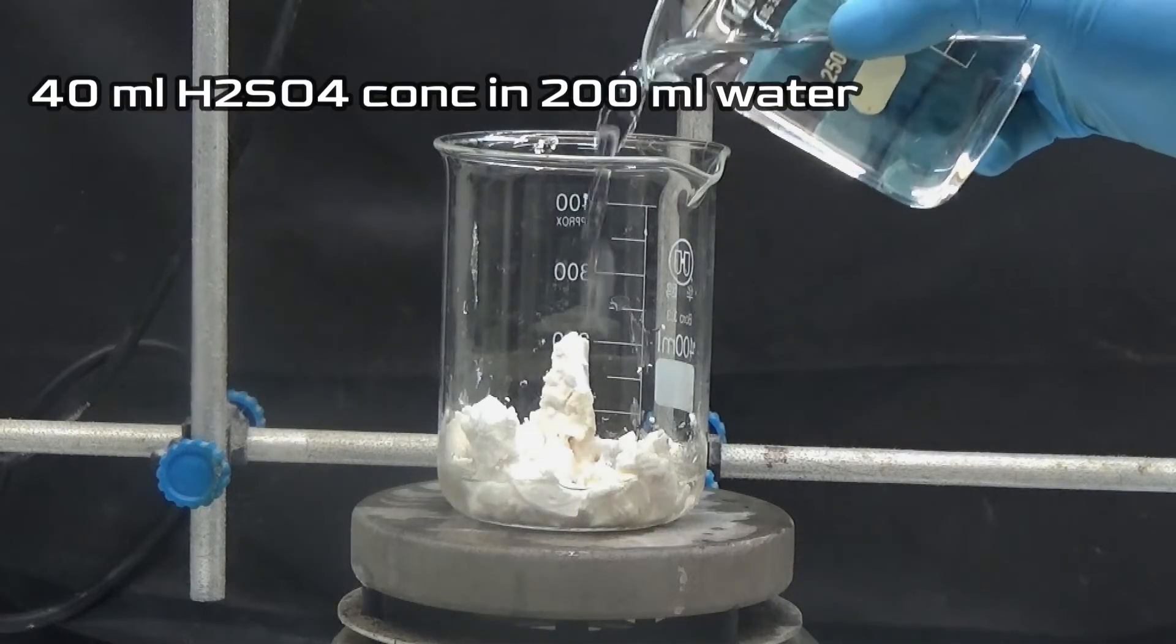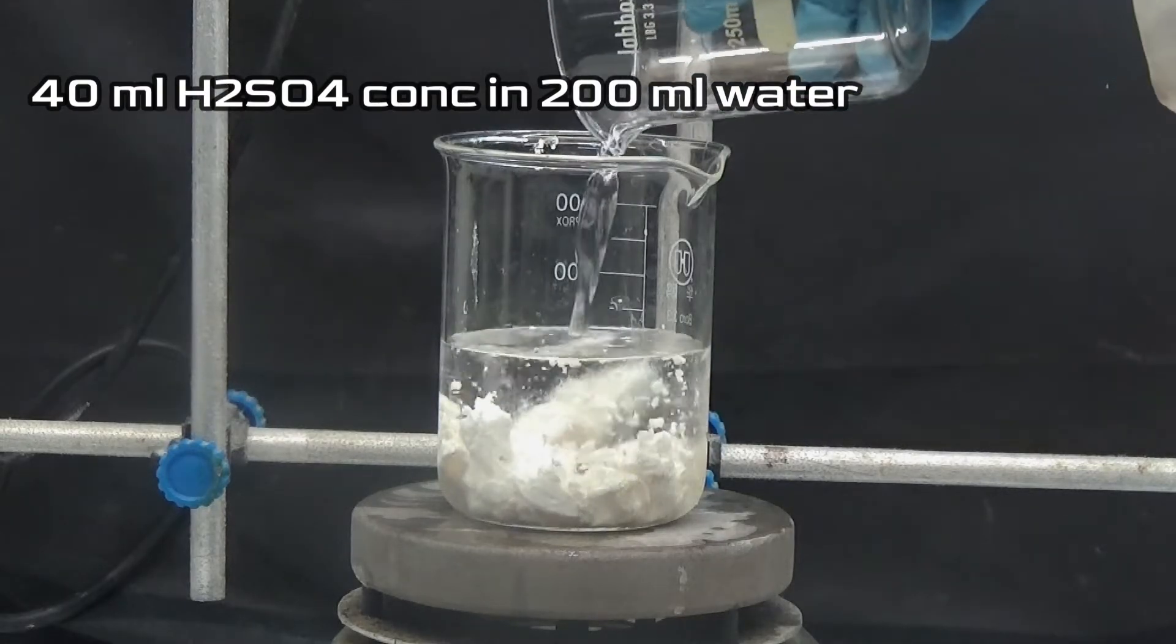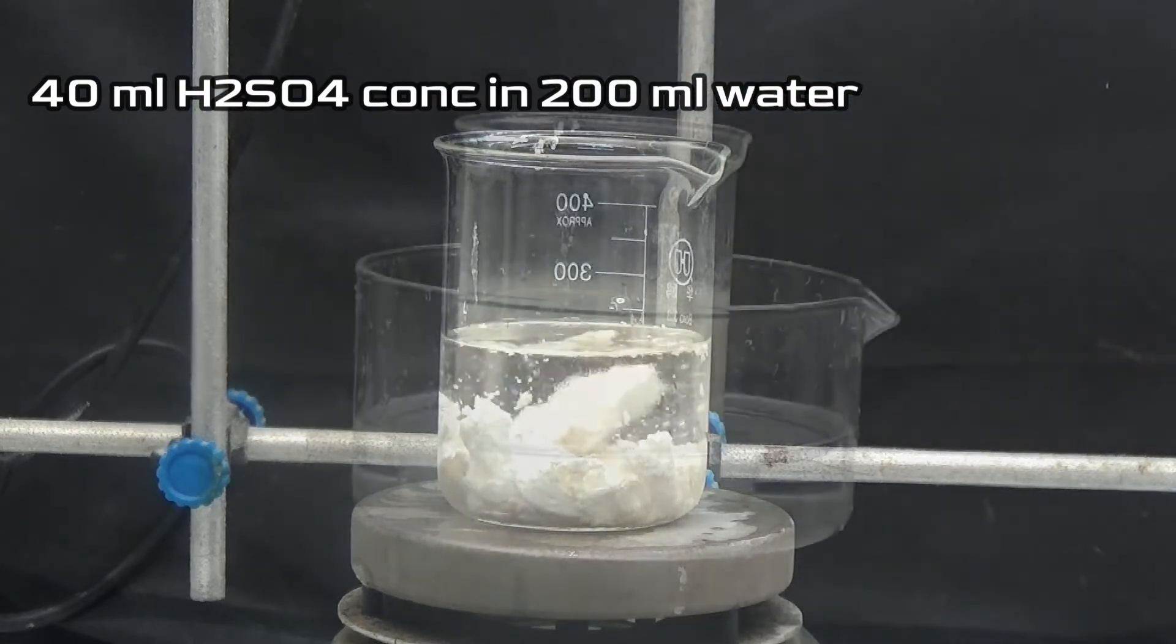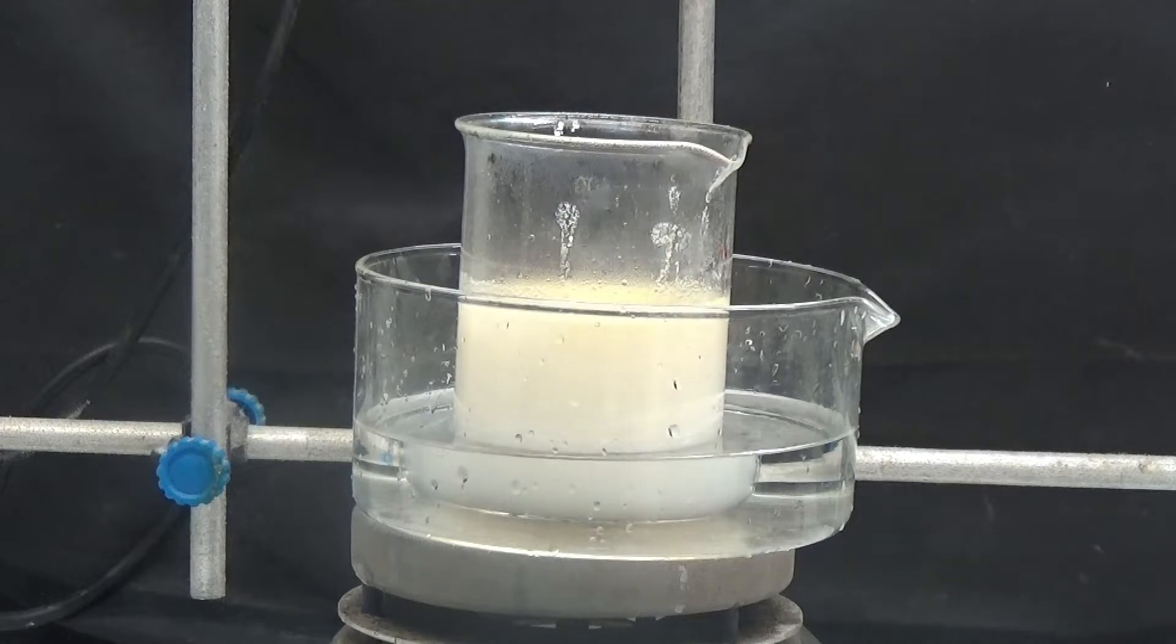Put the crystals in a 500 milliliters glass and add a solution of 40 milliliters of concentrated sulfuric acid in 200 milliliters of water. Once the diluted sulfuric acid has been added, put the glass in a warm water bath and shake for 30 minutes.